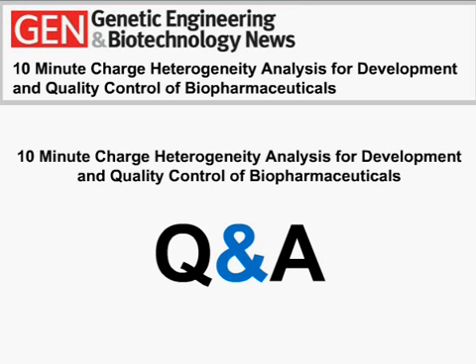And Karan, how much urea did you use for your sample prep? So for the ones that I showed in this presentation, the urea that was used was around 4 molar in the sample prep. But typically we check anything from 1 molar to 4 molar, and we have not yet gone above 4 molar urea in the sample prep. That is the upper point that we've tested. So I would say around 2 molar urea should be good enough for stabilizing effect.